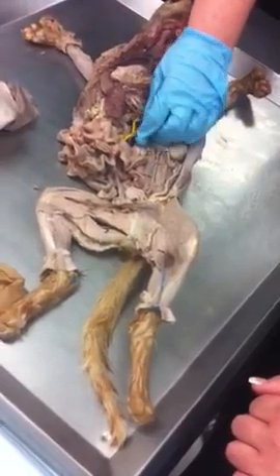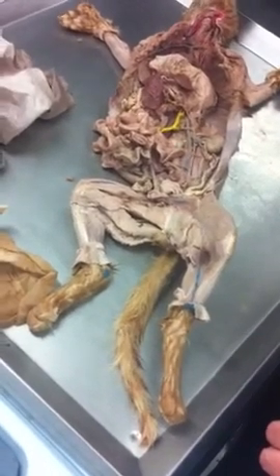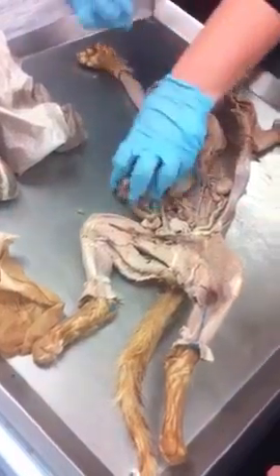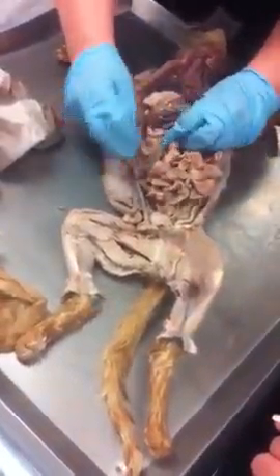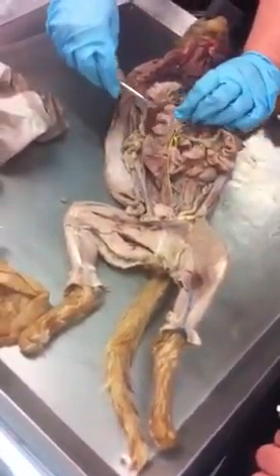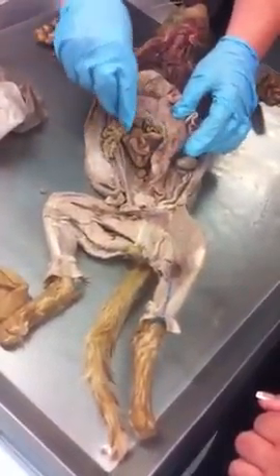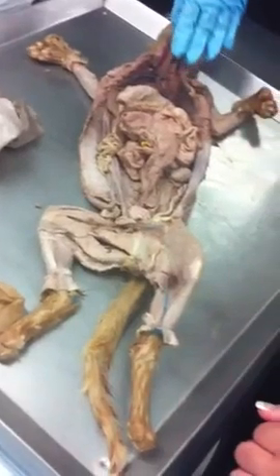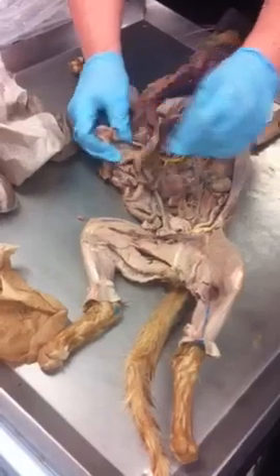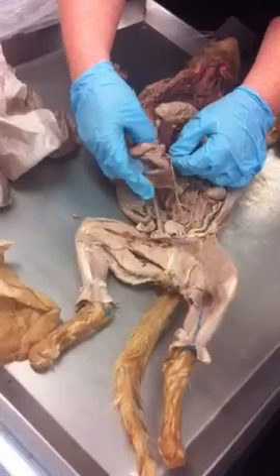This one's the one that's kind of hard, and I'd like you to take a look at this picture when you get a chance, because this shows you how it should be. Because I've been flopping guts left and right, twisting and turning, I'll never get them back this way. But in real life, the colon should be kind of like this, so that you have like an ascending and a little bit of a curvature, and they have the picture of how it really is. I'll never get it that way again. But the reason we want to do that is we want to follow these branches to where they go, and you have to keep flipping it around to do that.